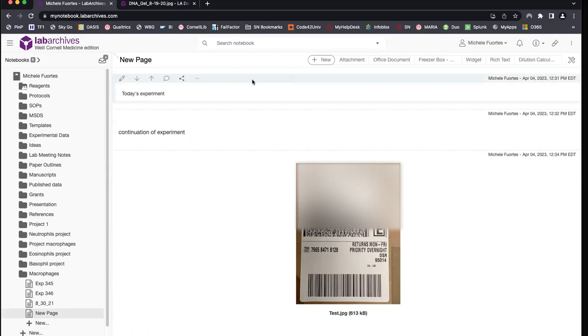that's a little bit tricky, but I think the best solution would be to create a new notebook with the things you want to share and just share those rather than sharing your main notebook, because there are going to be tons of pages that you don't want to share with the whole world, like templates, ideas, lab meeting notes, things like that. But yes, you can select a notebook and share the notebook. Yeah, ITS is working on it. It should be available pretty soon.